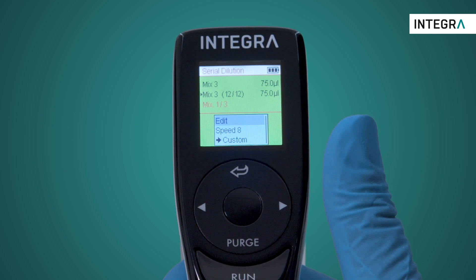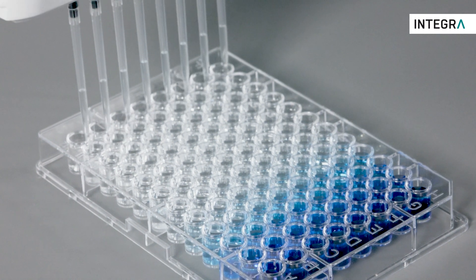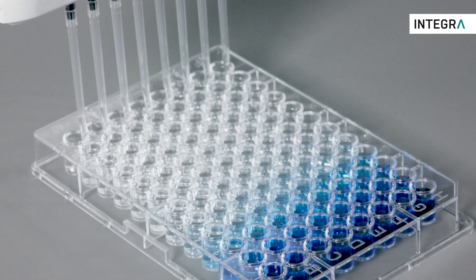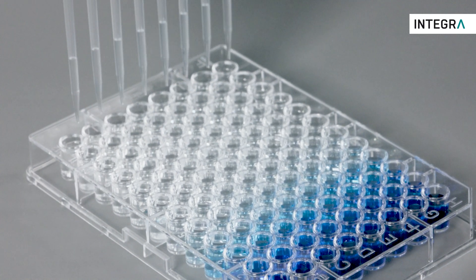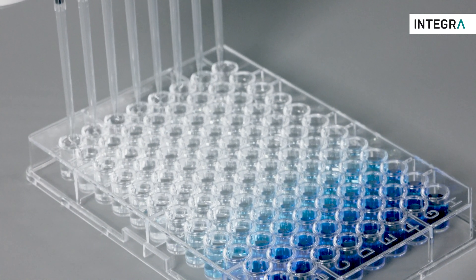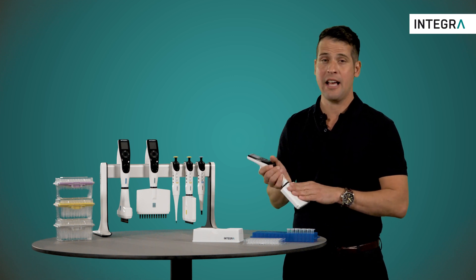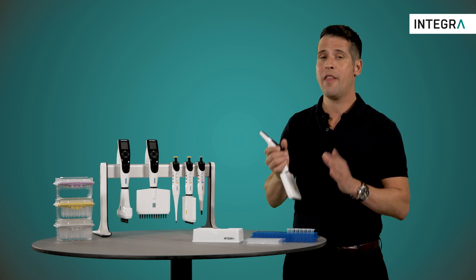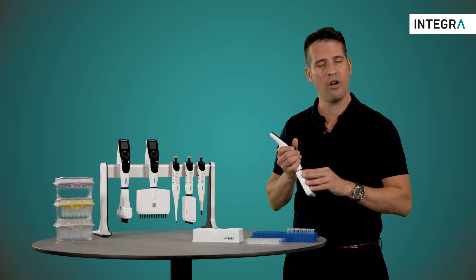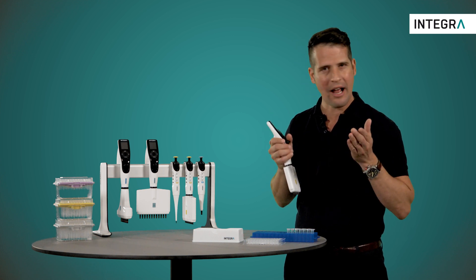Once the program is finished, you'll be left with mixed sample diluent in your tip, and you can decide what you want to do with it — either back in the last well, or into another container. The serial dilution mode with Integra's electronic pipettes saves a lot of time and aggravation, and helps you perform a dilution more accurately and precisely. That's a real benefit for any lab.